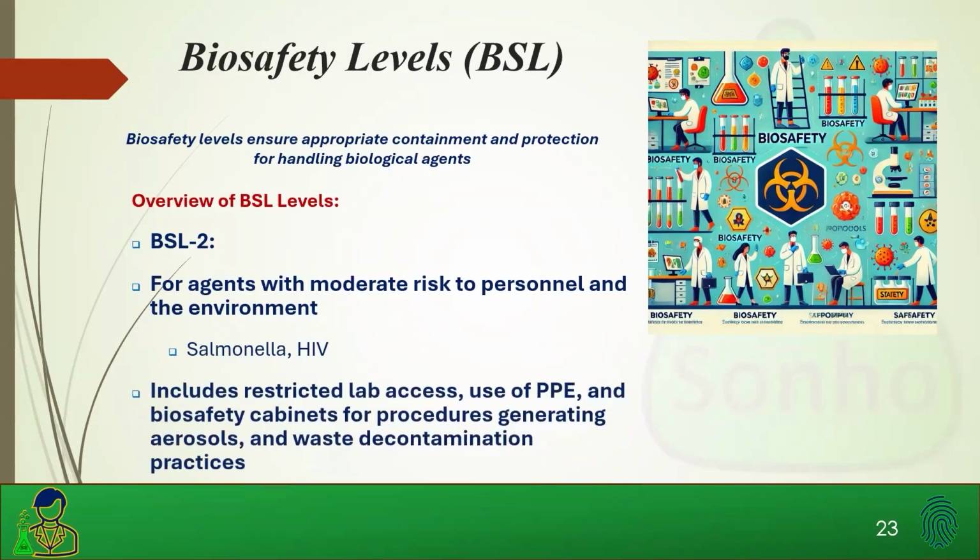These include restricted areas to lab access, use of PPE, and biosafety cabinets for procedures generating aerosols and waste decontamination practices. This is oftentimes any laboratory testing with potential bloodborne pathogens or anything testing infectious disease would fall at minimum BSL-2.